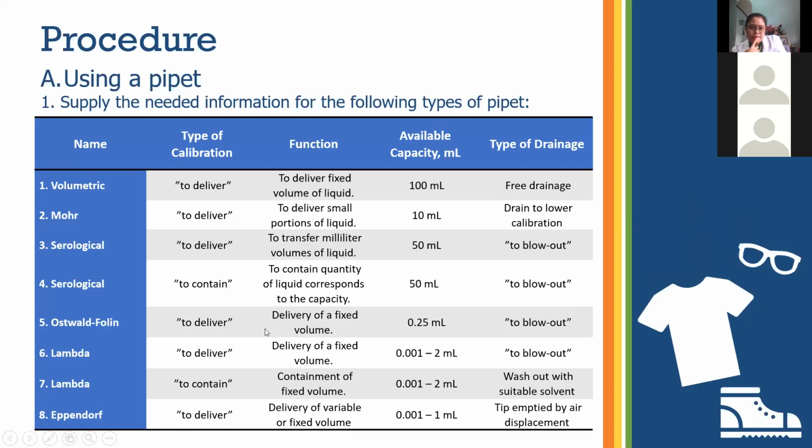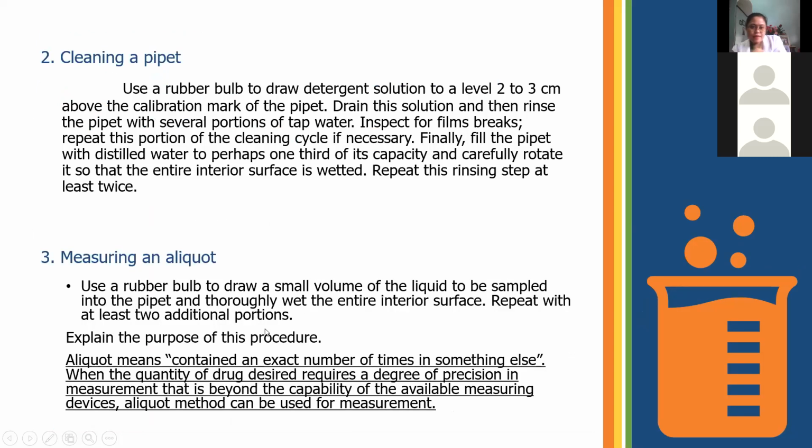So for the next part, Jamie, go. So hello, for cleaning a pipette. So how do we clean a pipette?